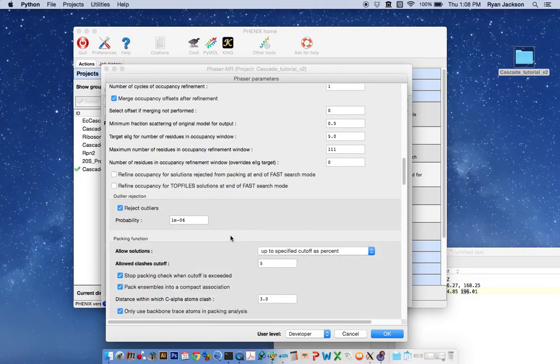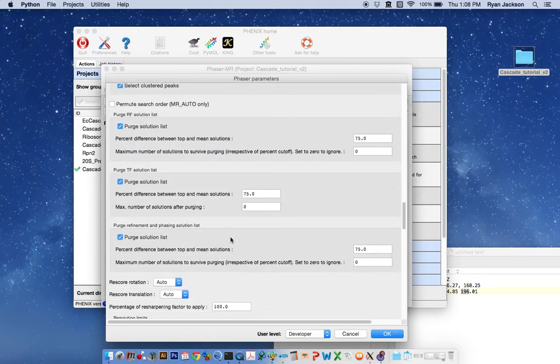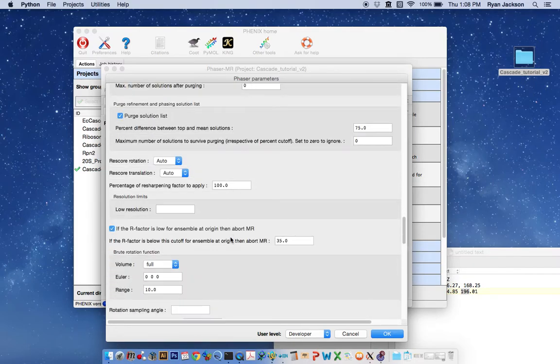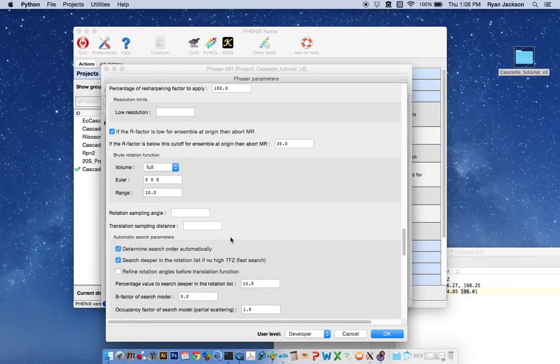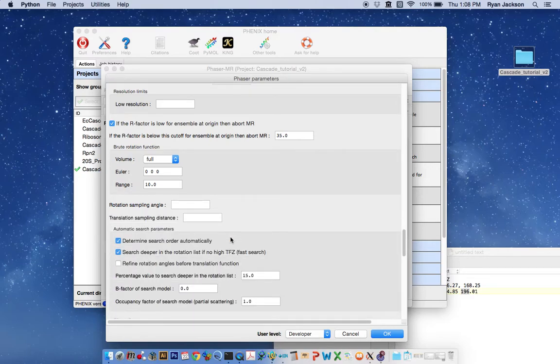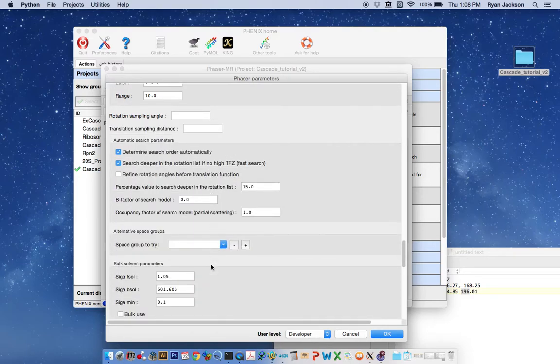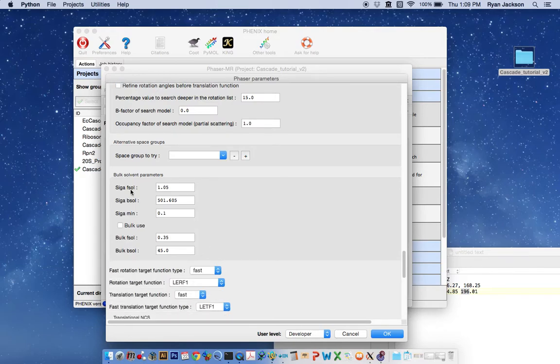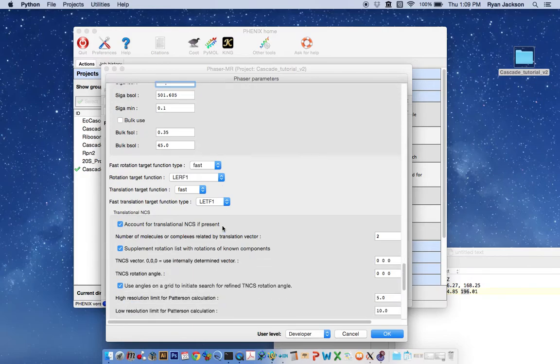And then to account for the difference in solvent scattering between an EM map, which is actually collected more correctly than an atomic search model, we want to change this default of 1.05 to something much smaller like 0.3. And we're going to hit OK.